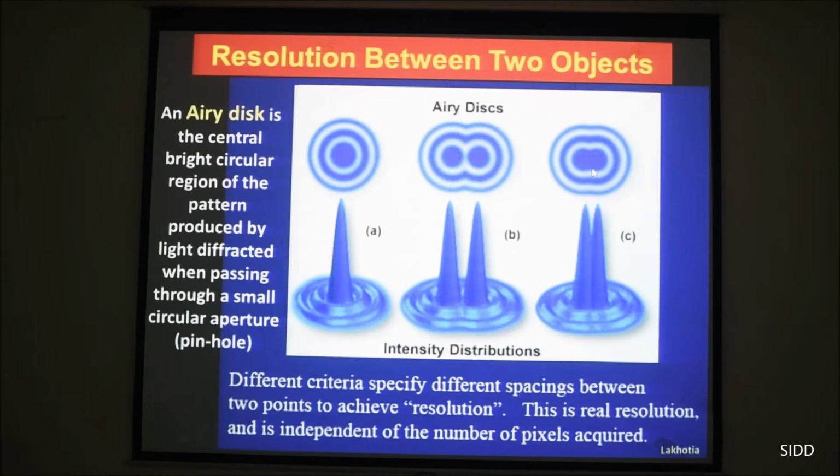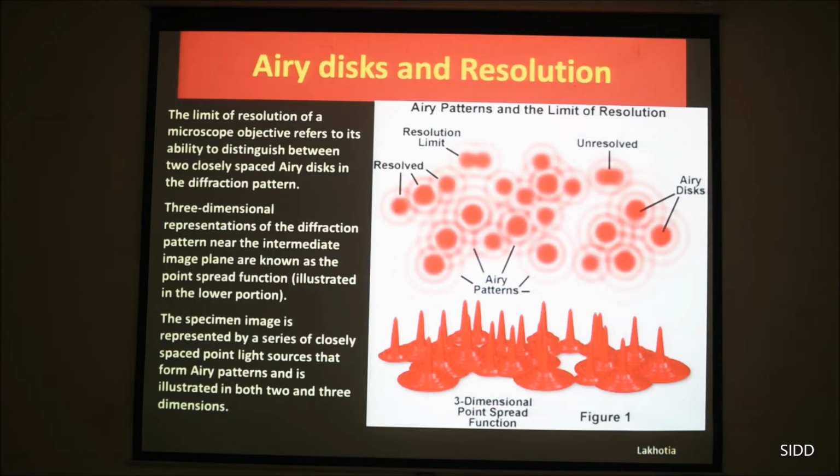The Airy disk and the diffraction that happens because of the edges from which the light refracts give a differential distribution. This property is now also being used in confocal microscopy to provide you super resolution, that if we can eliminate these fringes of light, we will get a much sharper image. This was a simple thing that we use now in deconvolution.